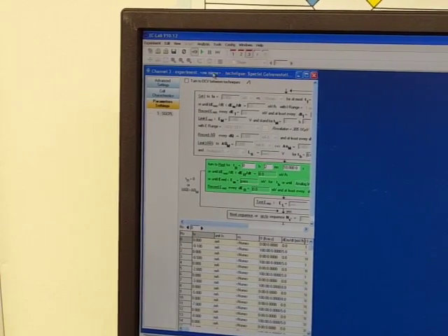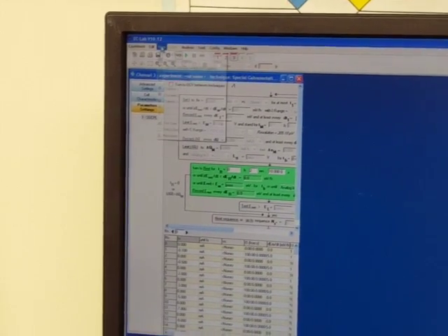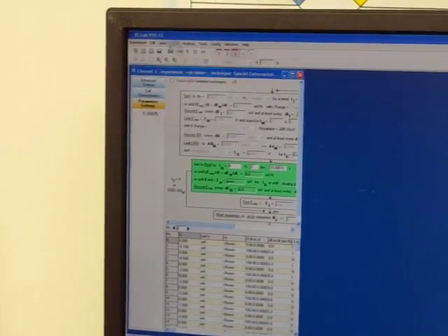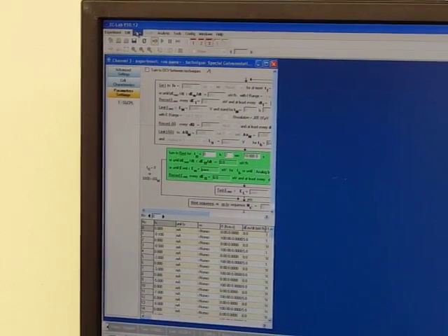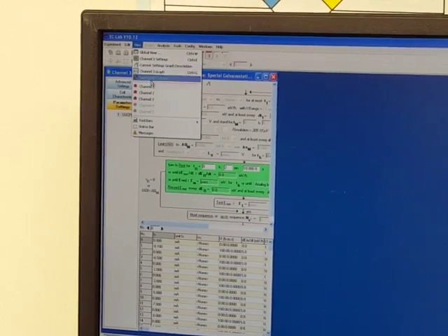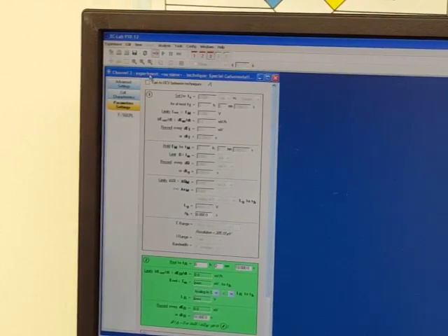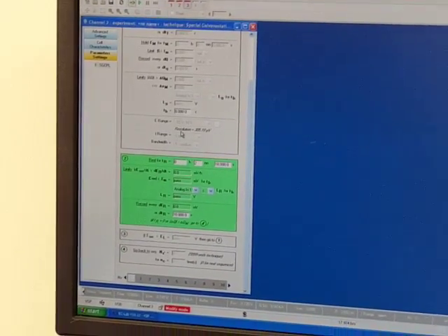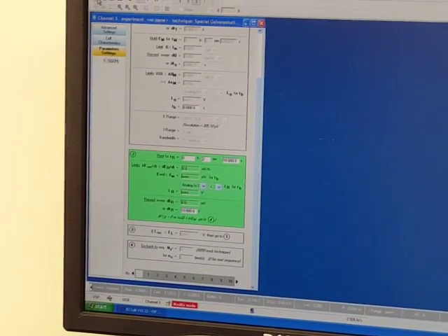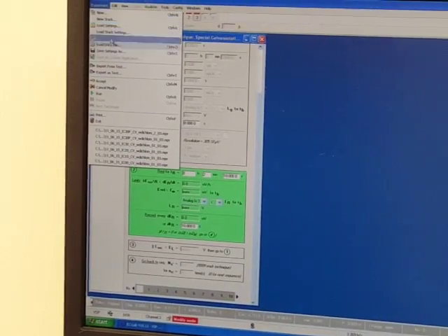And I need to change this view. I don't like the view. Oh, here it is. The global view. No, not that one. View. Settings and column. There we go. Is this the one that we want now? Yeah, this is okay. So this is it. So experiment.